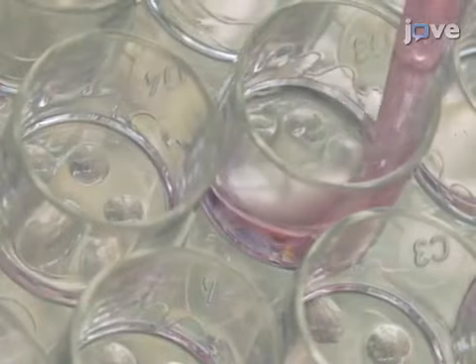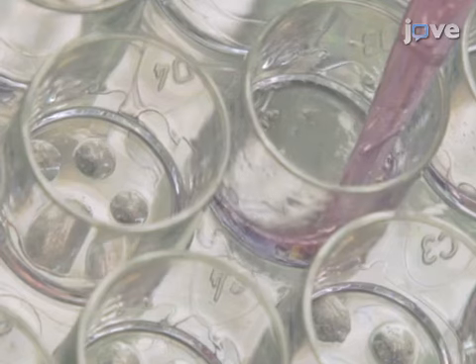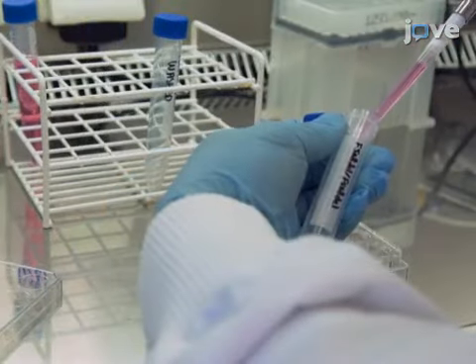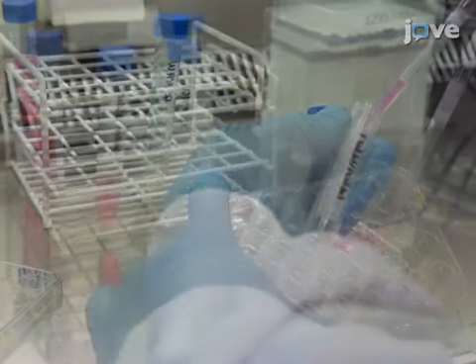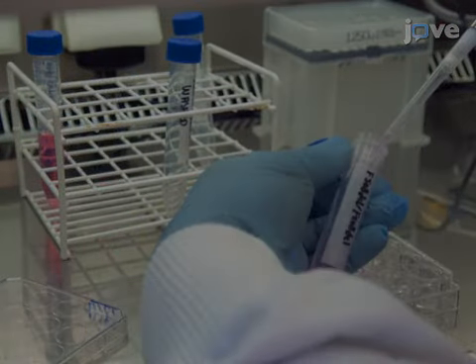Now use the pipette to break up the basement membrane matrix drops in each well and transfer the resulting organoid suspensions to the 15 ml tube with the sample name. Rinse each well with another milliliter of basal medium and pool the washes in the sample tube.